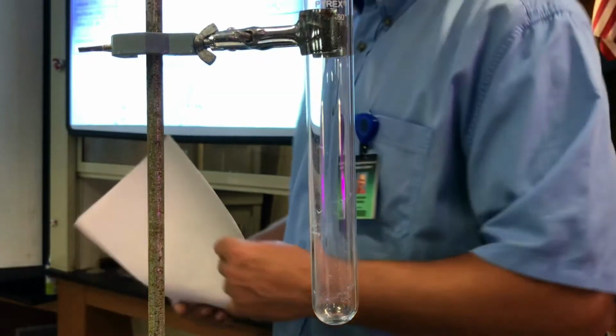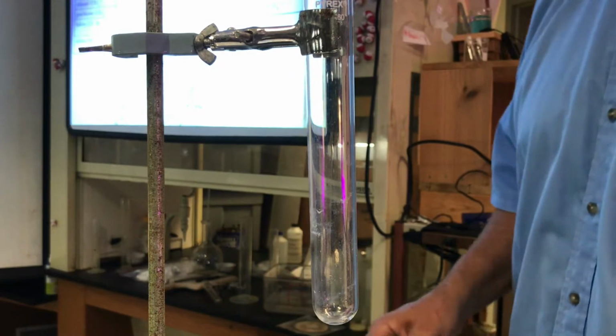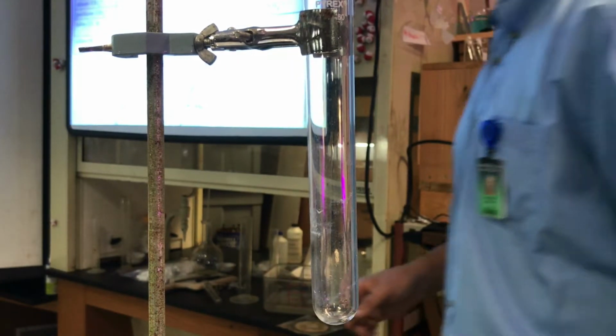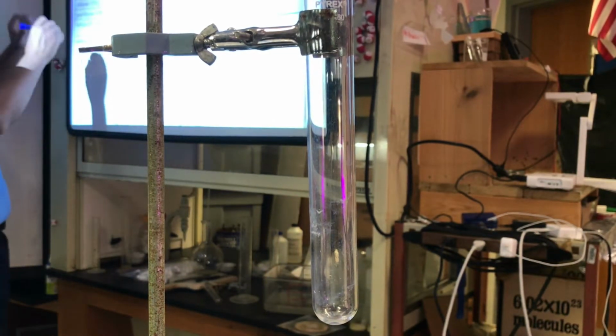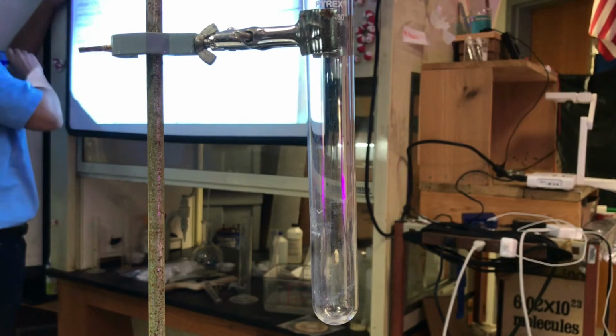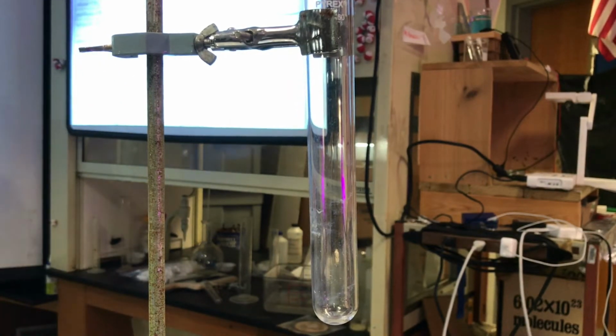Demonstration here. What I'm going to do is dissolve a couple of salts. The first salt I'm going to dissolve is lead nitrate. If I look at my nitrates, I see that nitrates are always soluble. What does that mean? It means that in water the ions are free, available, they're not stuck together.